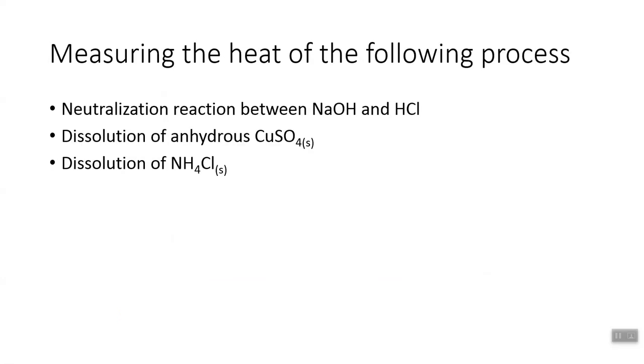From the value of the calorimeter constant, now we are ready to measure the heat of the following processes: a neutralization reaction between sodium hydroxide and hydrochloric acid, the dissolution of anhydrous copper sulfate, and the dissolution of ammonium chloride.